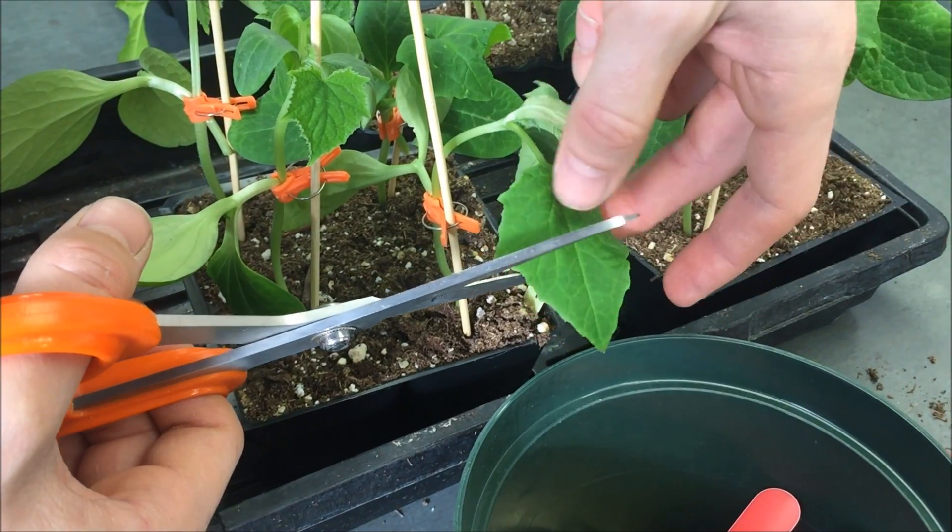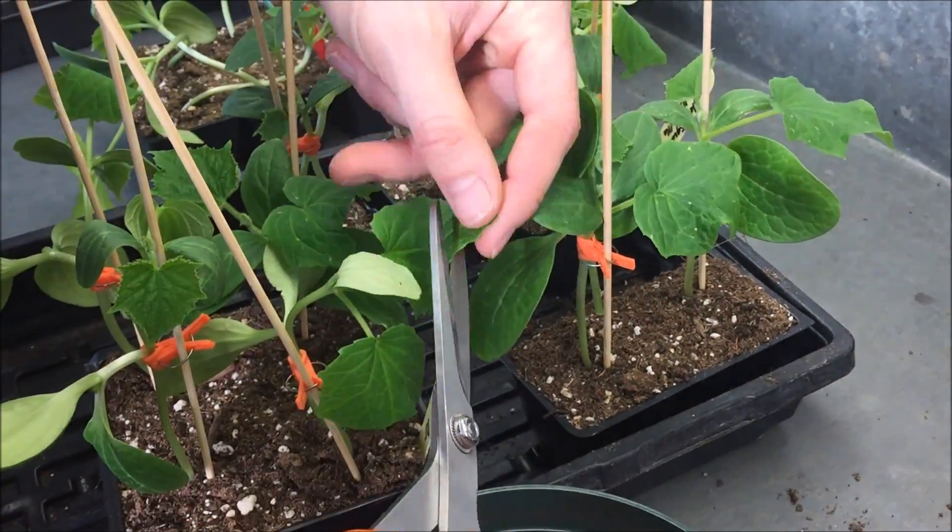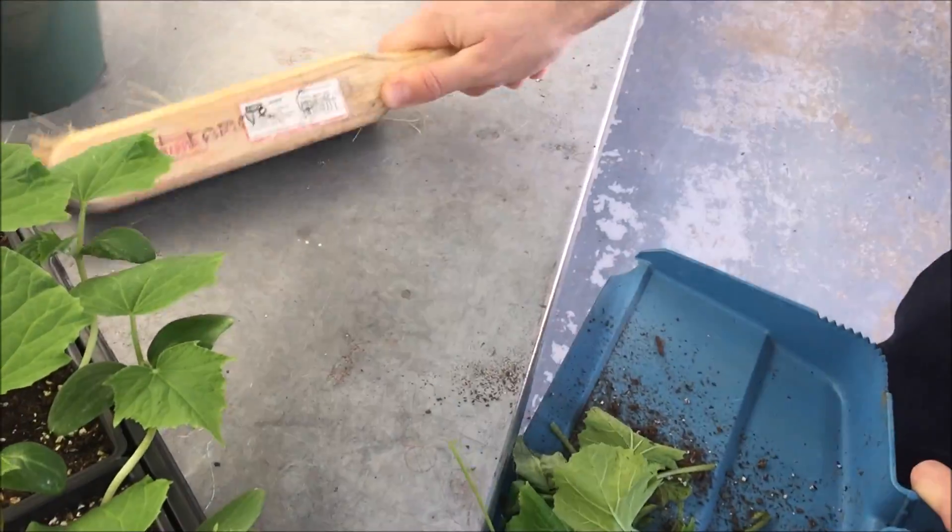Then trim the leaves using sharp scissors to decrease the water loss by transpiration. Good work! You have just done one good grafting. There are 79 more to do.